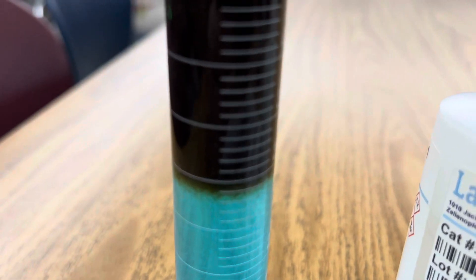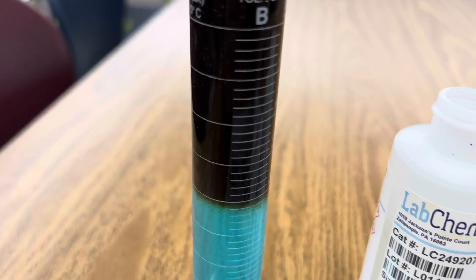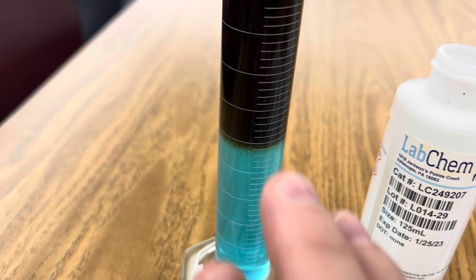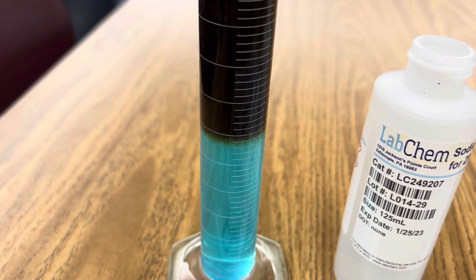It's very dark and will be suspended for a few minutes, until you'll actually see dark crystals of copper sulfide start to precipitate out of the solution.